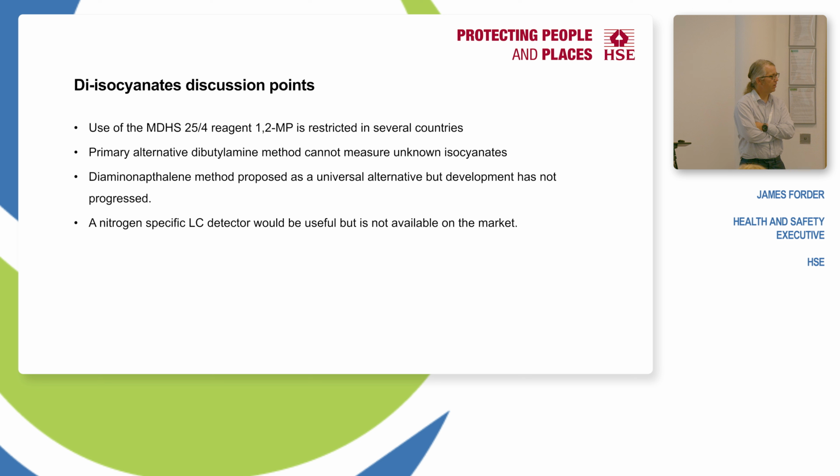Are there any implications for having a much more consistent and sensitive method of analysis for the workplace exposure limits? Well, yes, absolutely. Obviously the later peaks are broader, you have less sensitivity. If your isocyanate is mainly those peaks, then you will struggle to measure it against the workplace exposure limit because the sensitivity is a lot lower. So increased sensitivity will allow you to get to levels below the exposure limit. Okay. But it is a very sensitive method anyway.